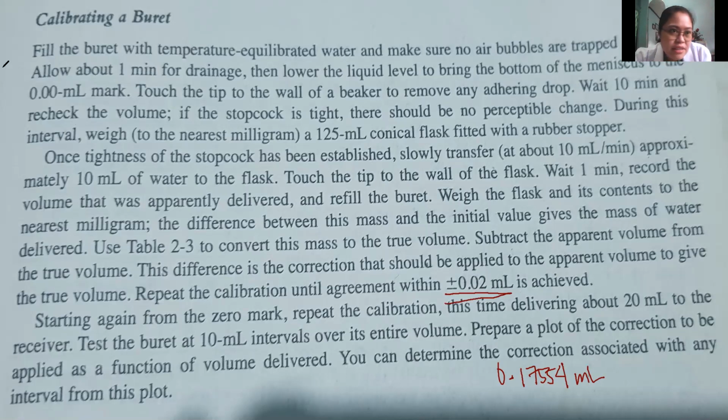Balik na pud ka sa first na procedure, compute na sad ka ulit hangtod, class, makuha nimo ni nga difference. Pag makuha na nimo nga difference, that's the time calibrated na imuhang burette, pwede na siya gamiton for the experiment. So kung gusto jud ka nang tinud-anay nga analytical testing, and then measuring the volume, na exact volume gyud, before gid nimo siya gamiton, mo calibrate sa imuhang burette. And this is how you do it.